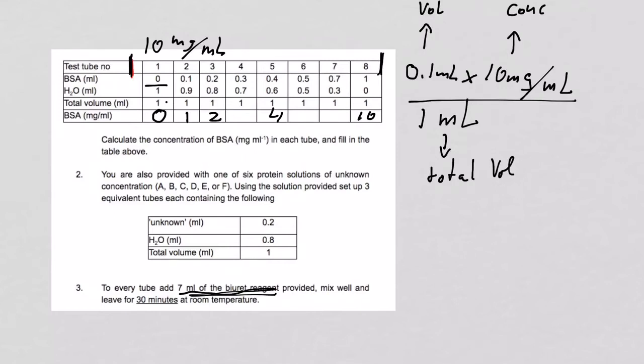You don't need any quartz cuvettes. You can use just simply plastic because we are not using UV light.